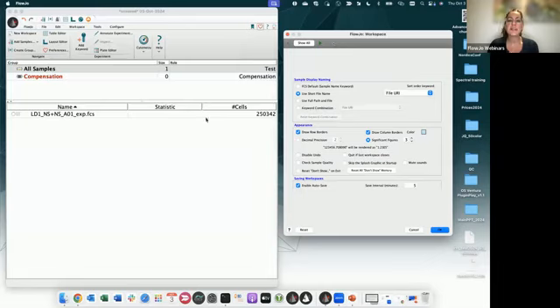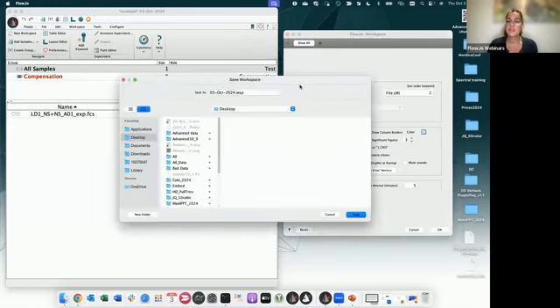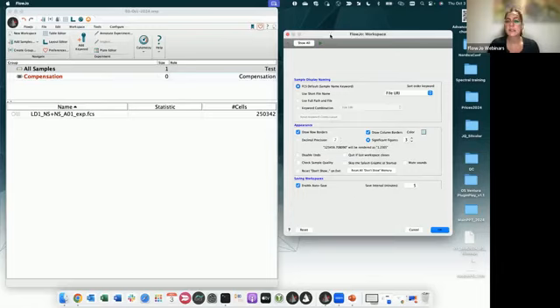If you see a different name right here, it's because you're using the FCS default name, which is what was assigned by the instrument itself. Let me save this. If you have the FCS default sample name keyword assigned in your preferences, then you will not see what you named your file at the instrument. Otherwise, you can just use the short file name.